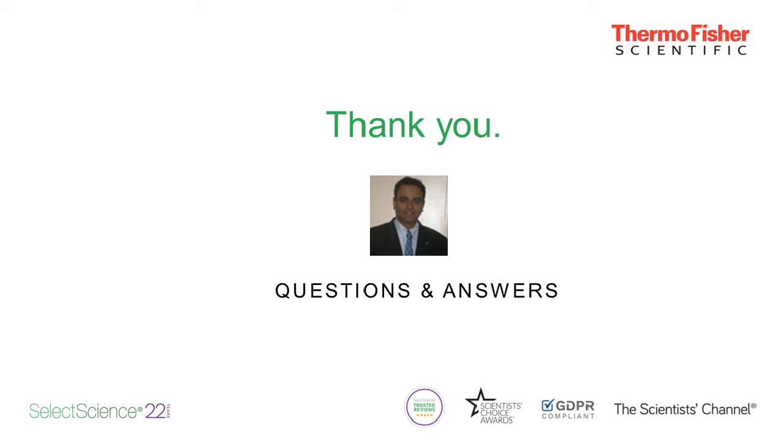Can we change the default data save location? Can customers still save data in different locations? Yes, the answer is yes. Basically, we are using Insight software, which has a security administration function. So you can configure that path in the security or administration, and that can be saved as an auto backup file. The security leads to 21 CFR Part 11 compliance, and that's why you have to choose that path to save the data in different locations if the customers want to.